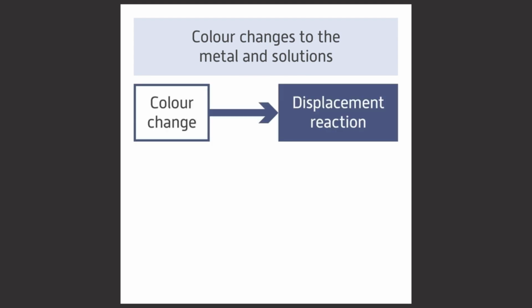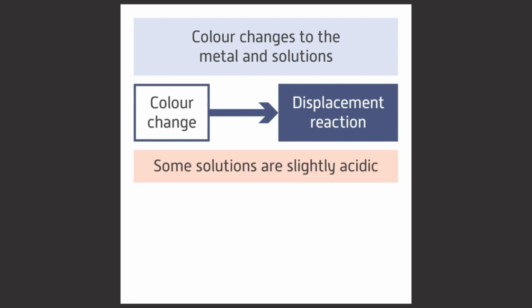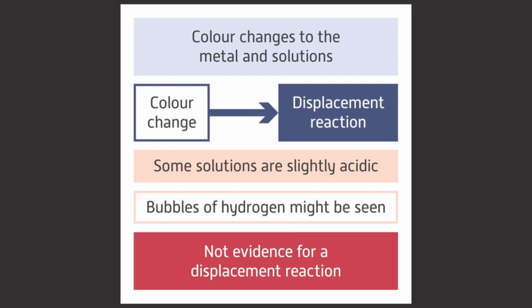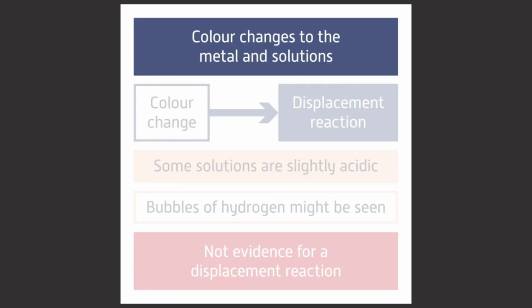If you see a colour change, this means that a displacement reaction has taken place. Some solutions are slightly acidic, so bubbles of hydrogen might be seen. Remember, this doesn't count as evidence for a displacement reaction. You are only looking for a colour change.